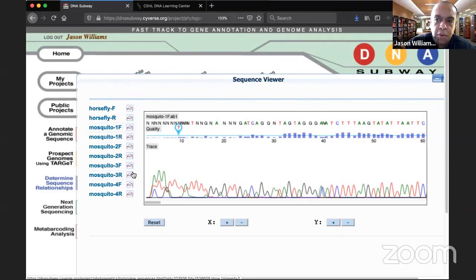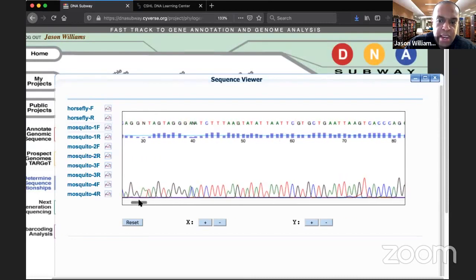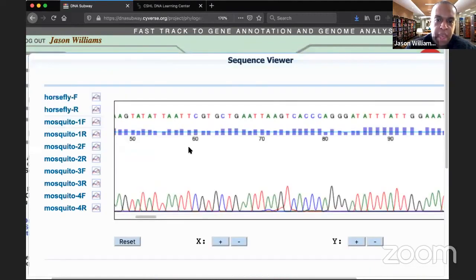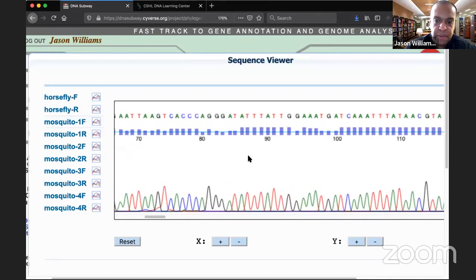And the goal for you to understand is that when we look at sequence data, look at sequence quality, those A's, C's, T's, and G's are not all equal. If we scroll down, okay, we can actually see that those bars going across the top, which I reminded you last time, have to do with sequence quality, and which we're going to deal with in just a moment a little bit deeper, mean that these A's, C's, T's, and G's are not all the same, okay?